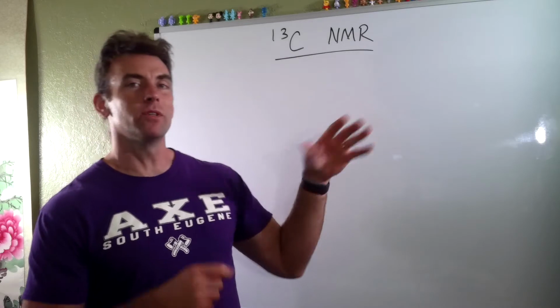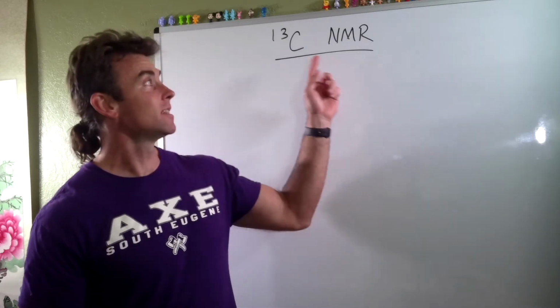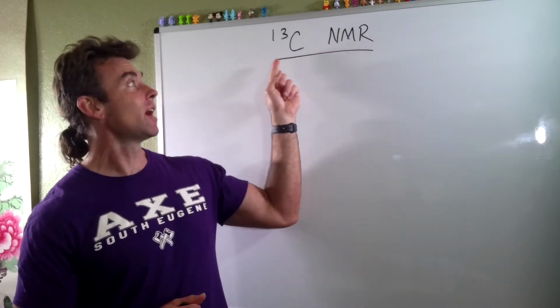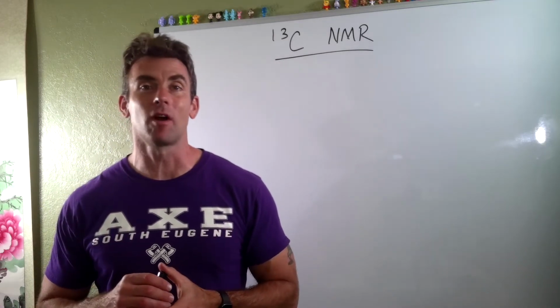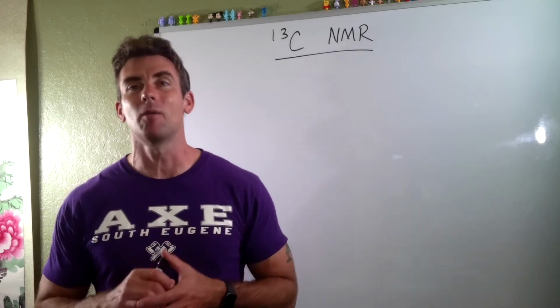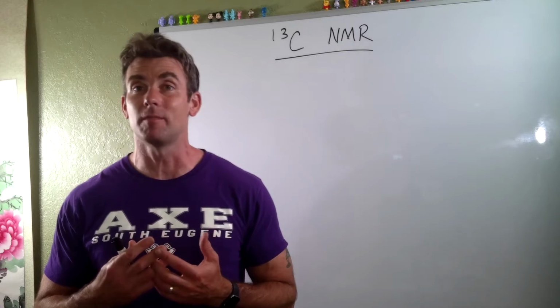But what we're going to do is talk about the products of nuclear magnetic resonance, in this case, NMR, and we're going to concentrate on a very particular nucleus, which is C13, a particular isotope of carbon. The theory is going to wait until later. First, I just wanted to show you how NMR works in terms of the symmetry of molecules.